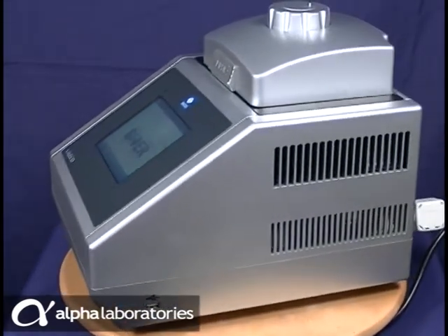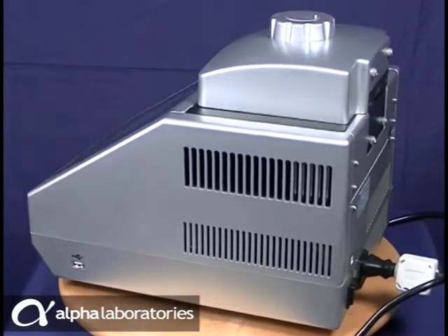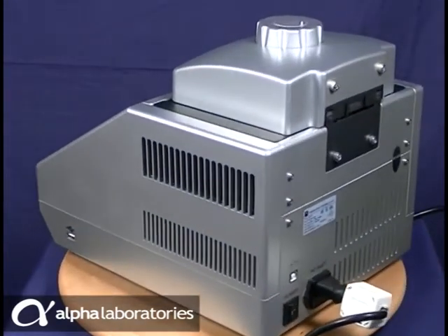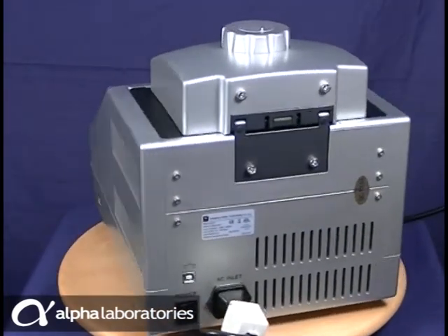The neat compact design has its power input on the reverse next to the on-off switch and a network port that enables up to 30 units to be coupled together and controlled centrally.